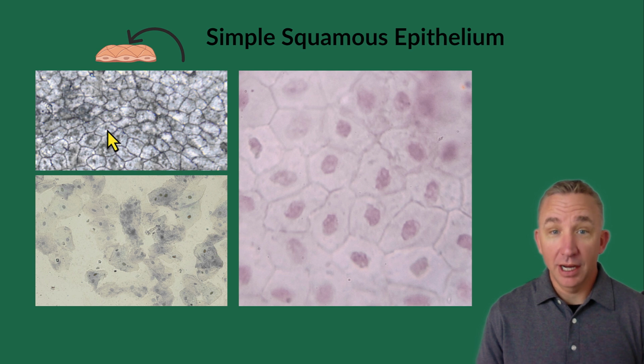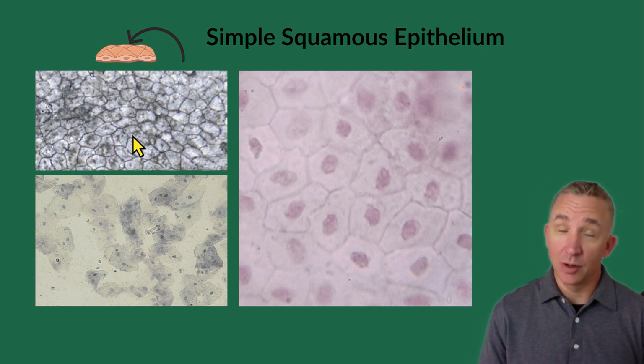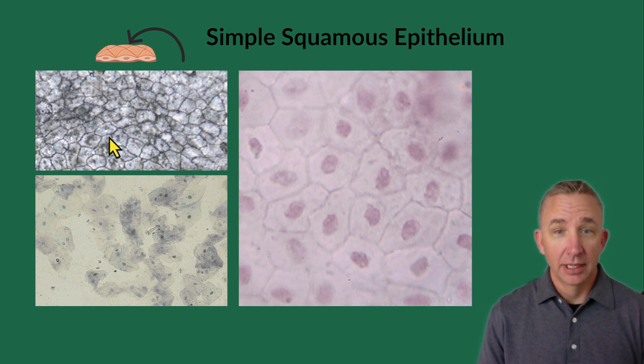Remember, the dark dot in the middle indicates the nuclei, and then the surrounding line around it is my cell membrane, plasma membrane, or plasmalemma. Any of those three terms work. And then we're just looking at the material inside the cell, which then is the cytoplasm.